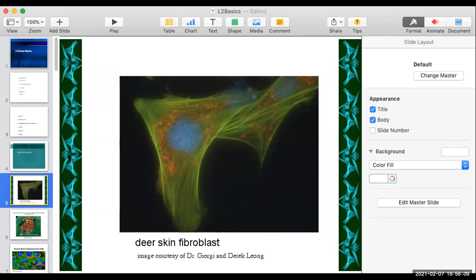That's correct if you said fluorescence. You can tell it's fluorescent due to a number of things: the characteristically bright colors — green, red, yellow, and blue are very typical of fluorescence. Also, the super black background is a clear giveaway that you're looking at a fluorescence image.